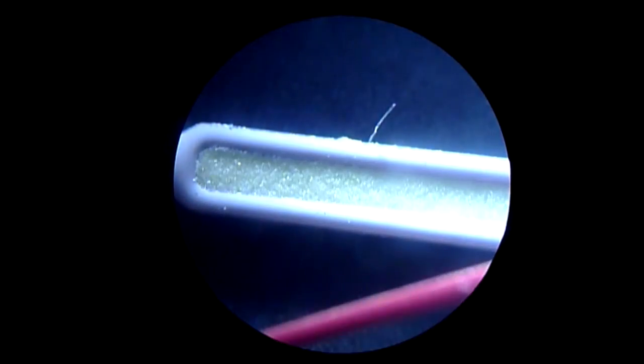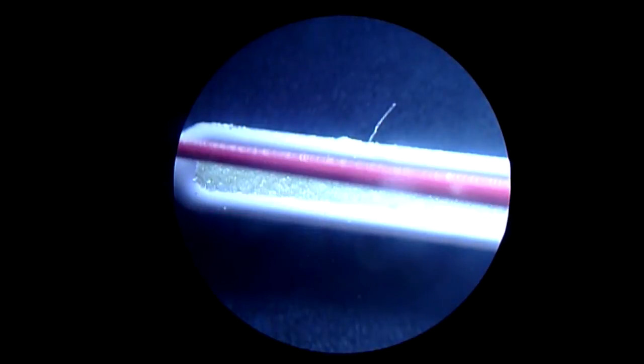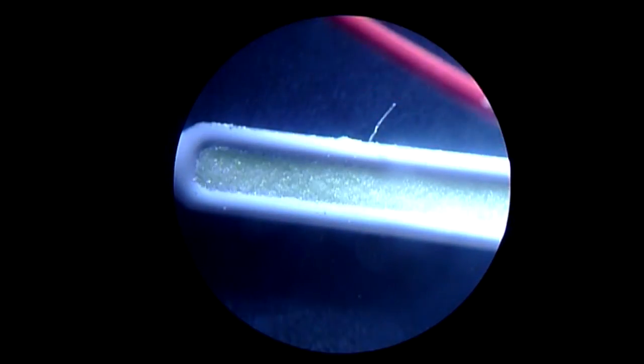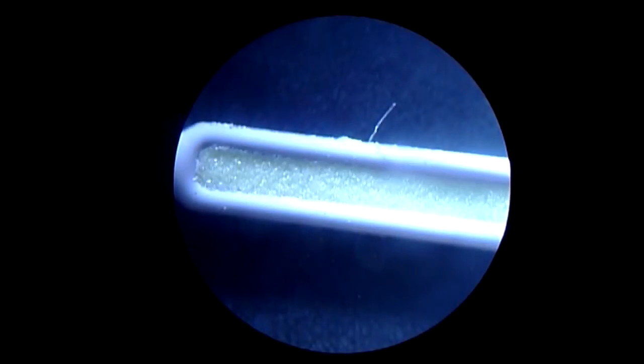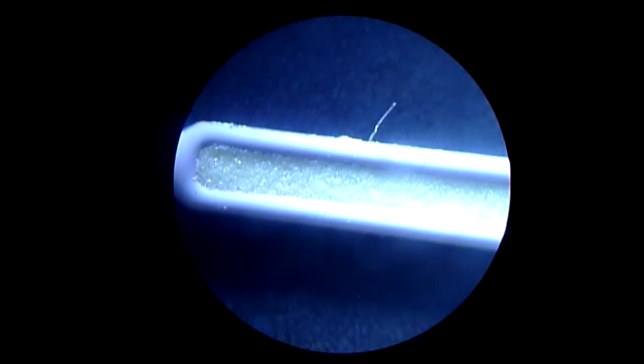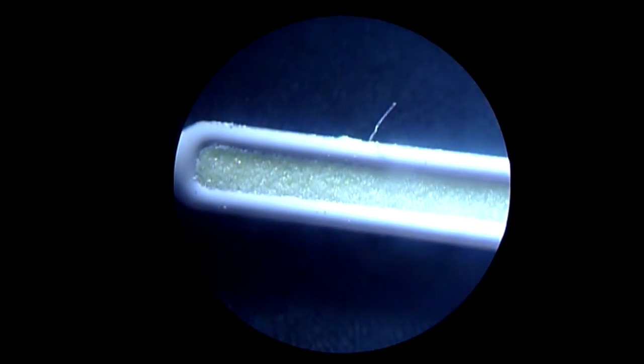Now here's a fun little subject. Do you know what this is? You can tell what's happening. That's pretty good timing. I didn't mean to do that. If you're familiar with watches, you know it's a watch. It's the hour hand of my Wenger watch. You can see all the embedded crystals there for the fluorescent effect.